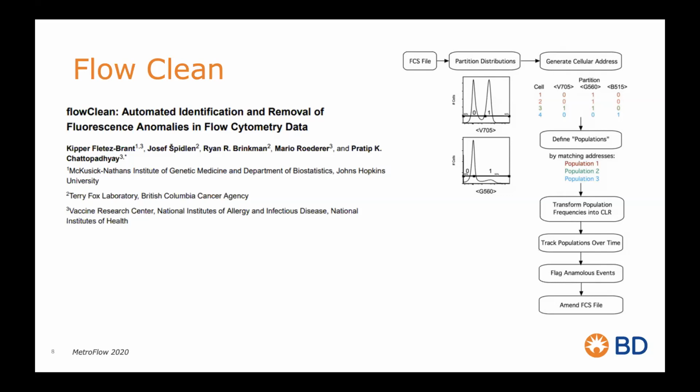I tend to like FlowAI mostly because I feel like I've got some better control over it through the settings and the tunables, and it makes a really nice report. I laugh a little bit, but it's important to be able to know why an algorithm has stripped out the cells, and I love the reporting functionality out of it. So when I get to demo time, I will demo that one for you.